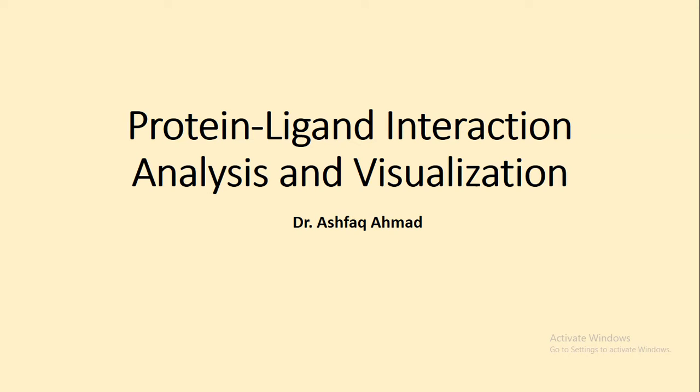In our last video, I taught you how to generate an overall view of the inhibitor and protein using PyMOL. You can generate this view from a PDB structure or for the structure you docked using any program. Today we will learn how to analyze specific interaction in PyMOL. In our last video, I did not discuss the analysis and visualization of specific interaction.